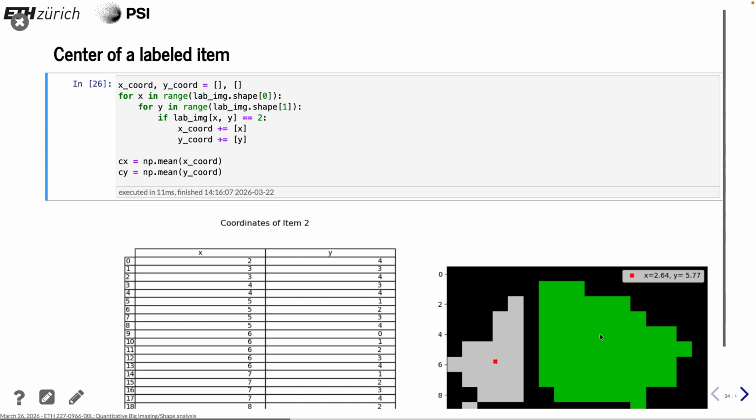And that is pretty good to have this information, because then you can start doing spatial correlation between shapes and areas and their position, and telling, okay, in this corner we have larger objects than we have in that corner, and that can help you to do your analysis of your images. Can also tell you if you have clusters of different objects based on this information.